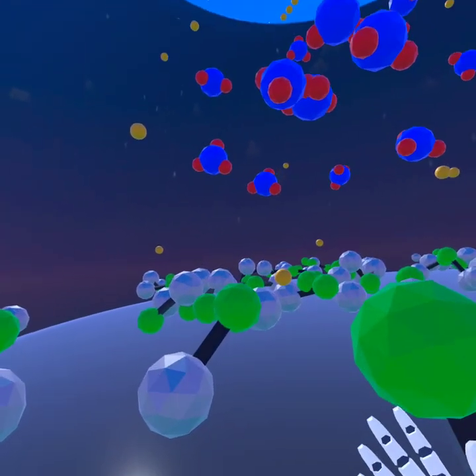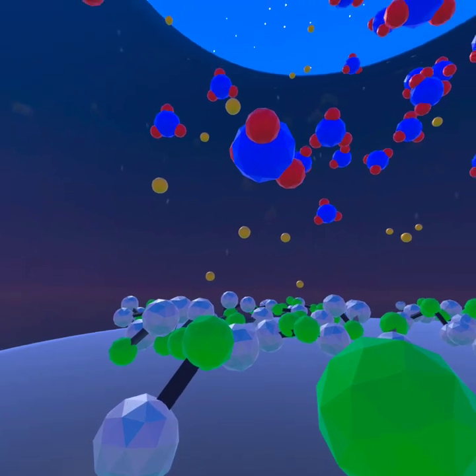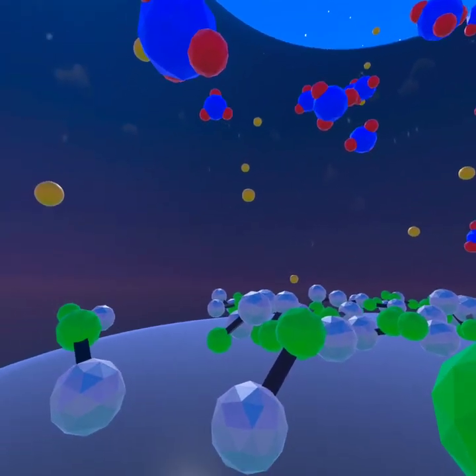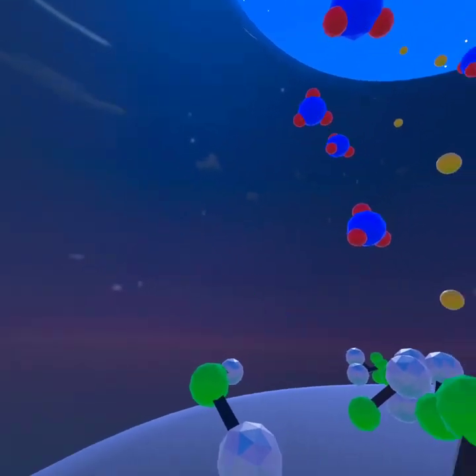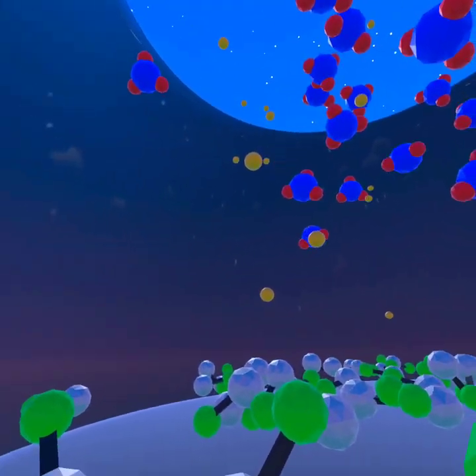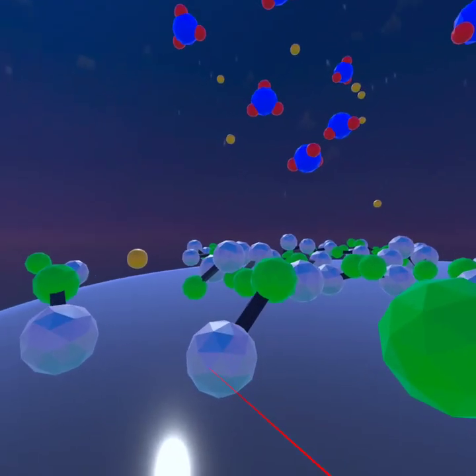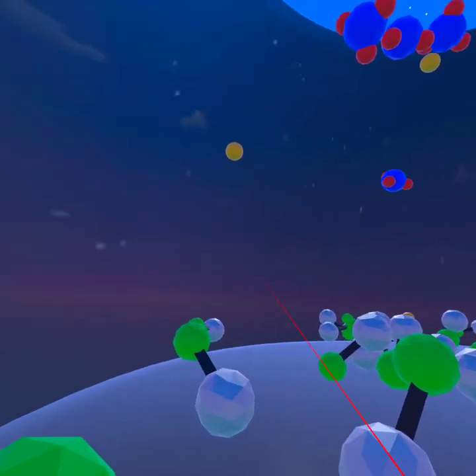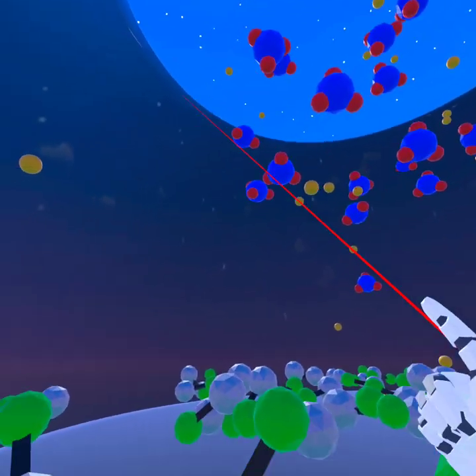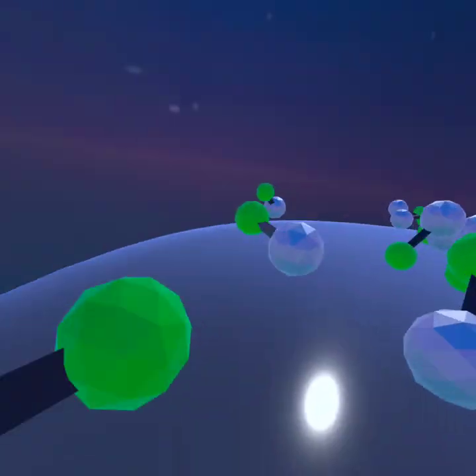So this is a great way to visualize, because a lot of students struggle with what is really happening at a molecular level when they see a color change. They think all of the molecules take part, or, oh, this is always in there. No, they were floating around, and then they found a chlorine, and because this bond is stronger than that of water, they'll come together, and then they'll fall out of solution. But there's stuff that doesn't do that.